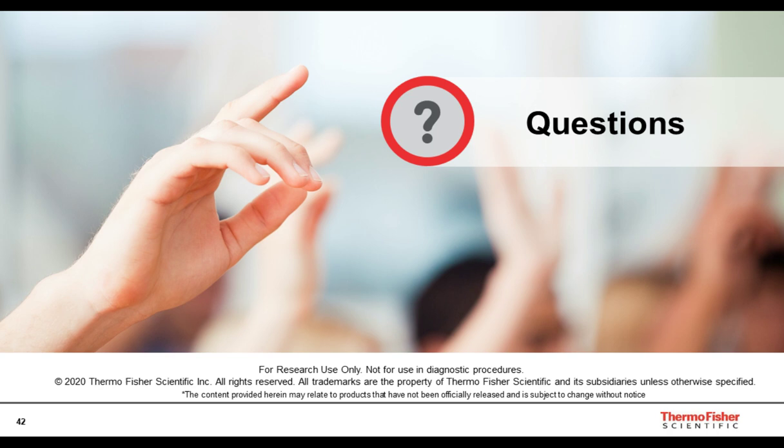Okay, gotcha. So yes, the current design tool, TrueDesign, is loaded with the human genome. We are still in development of that tool to build out additional features. We are planning on adding additional genomes, specifically mouse, at least within 2020, and we're looking to add rat, zebrafish, and some other model organisms to the TrueDesign platform over the next couple months.